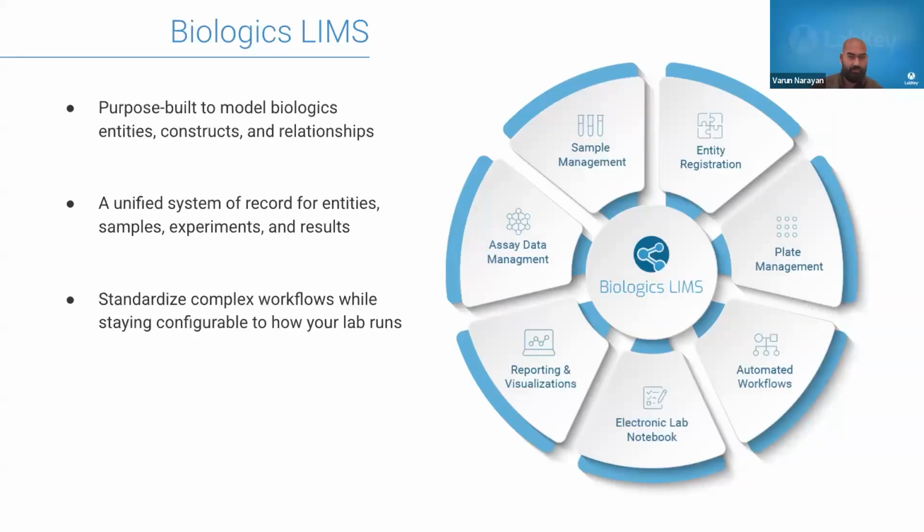It allows you to standardize complex workflows while staying configurable to how your lab runs at the same time. So you can create repeatable templates that allow you to easily standardize your most routine processes and cut down on avenues for human error. But it's also flexible enough to grow with your own team. As you add modalities or add new groups or sites, the software is flexible enough to adapt to these new workflows and new processes that you're going to be utilizing as well.